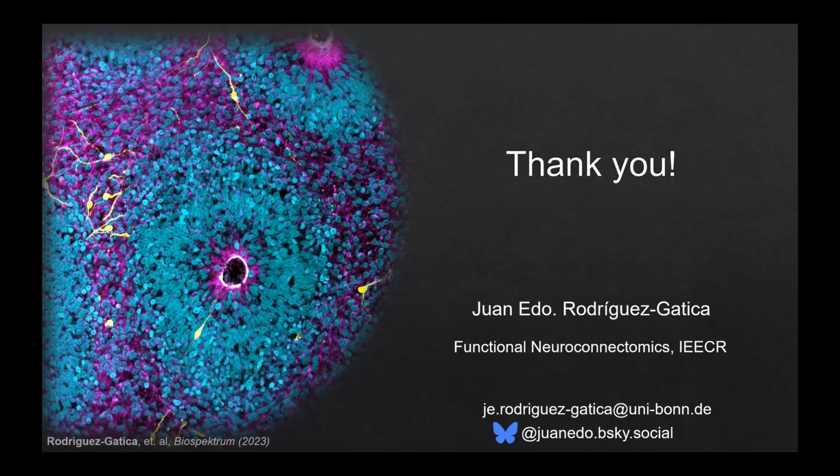Yeah, so basically like that. Or you can also increase the amount of proteinase K. In our case, I would like to mention, now that you mentioned the digestion steps, we don't use SDS. We usually recommend not using SDS because then you lose a lot of the fluorescence of fluorescent proteins like GFP, tdTomato, and so on, that are usually protected by their structure from proteinase K. For example, GFP, right, with this beta-barrel structure, is usually not digested. But if you use SDS, usually you start to lose fluorescence.